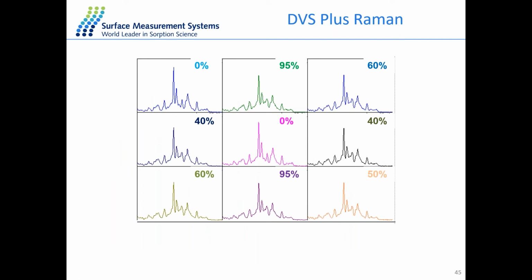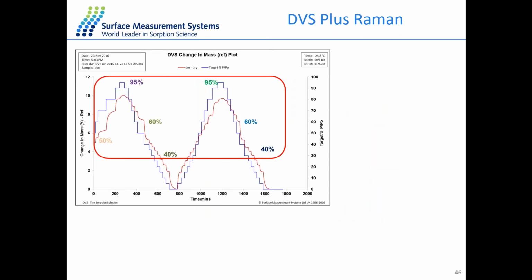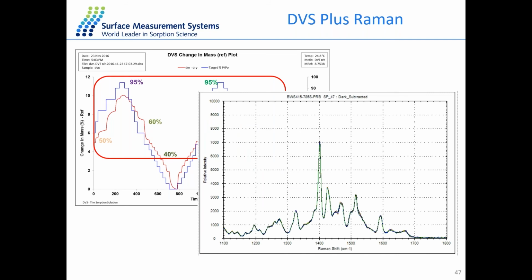So for this specific sample of full material, what we notice, for example, is that whenever we look at the spectra of the material that contains water over 40%, the Raman data are perfectly overlapping, covering exactly the same point, same intensity, same position of the peak.